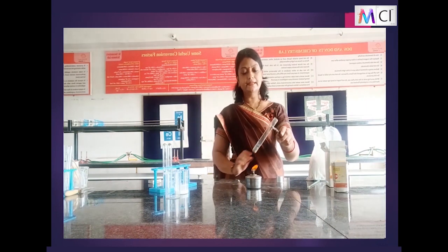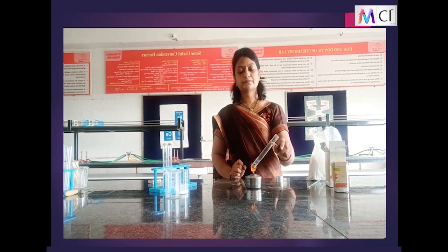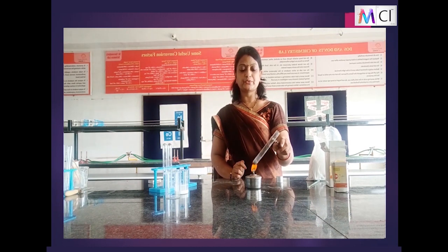Now let us heat the mixture. We will keep on heating the mixture. Children, without heating, could I separate iron and sulfur? Yes, with the help of a bar magnet we can do it, isn't it? Let us see what happens on heating.